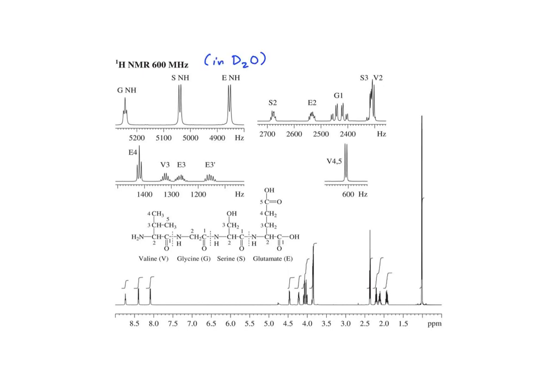That will result in deuterium exchange of the hydroxyl proton and also the ammonium proton, and under neutral conditions, deprotonation of the carboxylates.